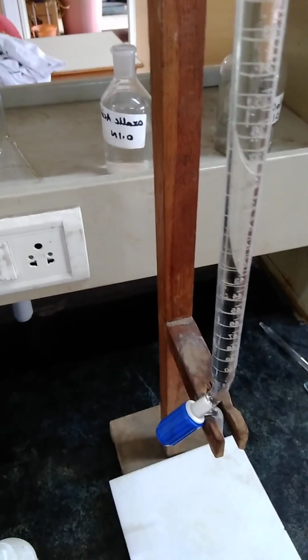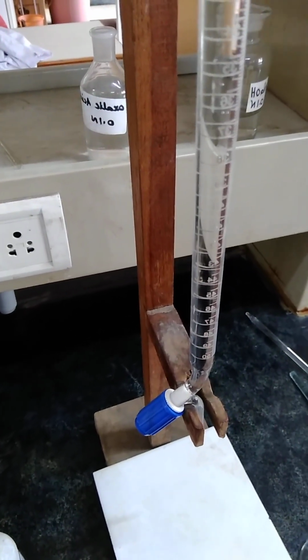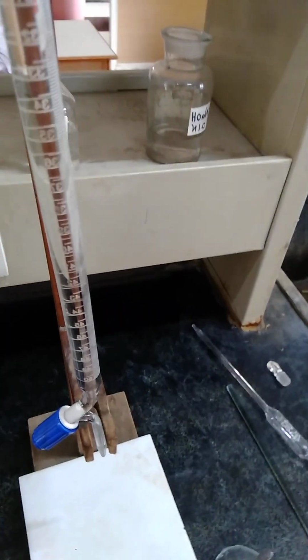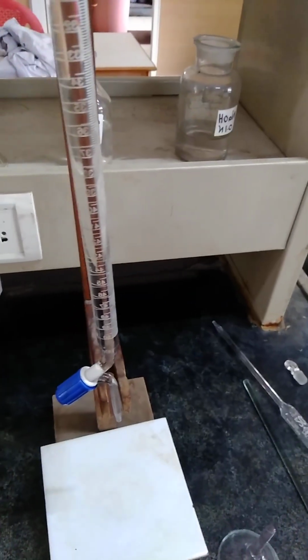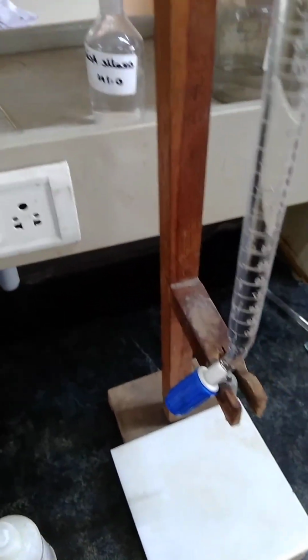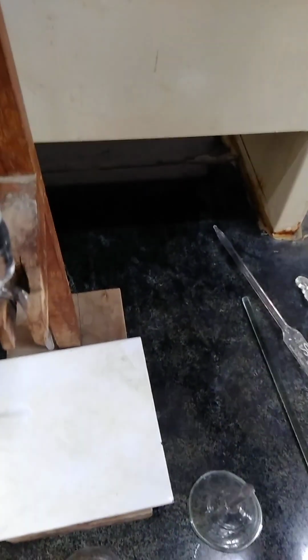So for this we need the connecting solution, whose normality is given. For example, the estimation of oxalic acid, the estimation of HCl. We have sodium hydroxide, which is actually the unknown one.